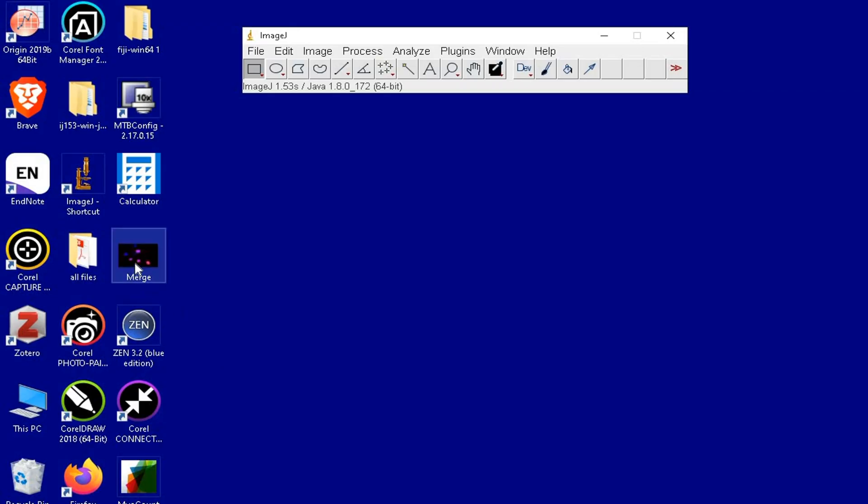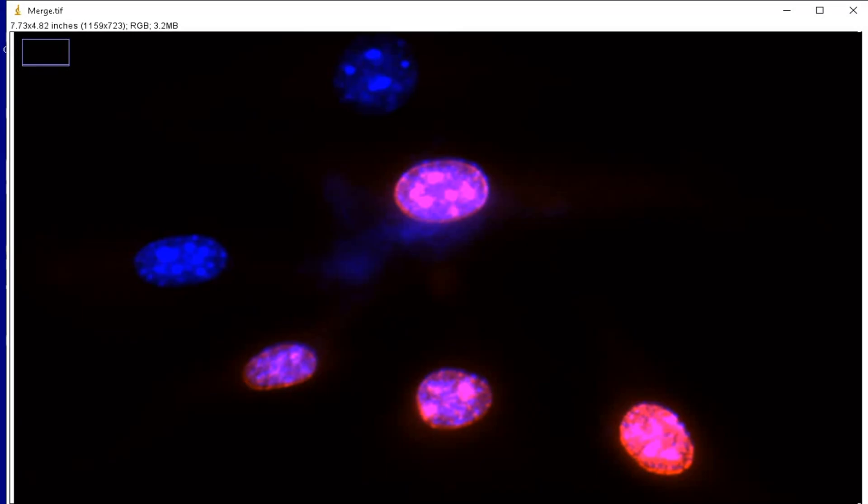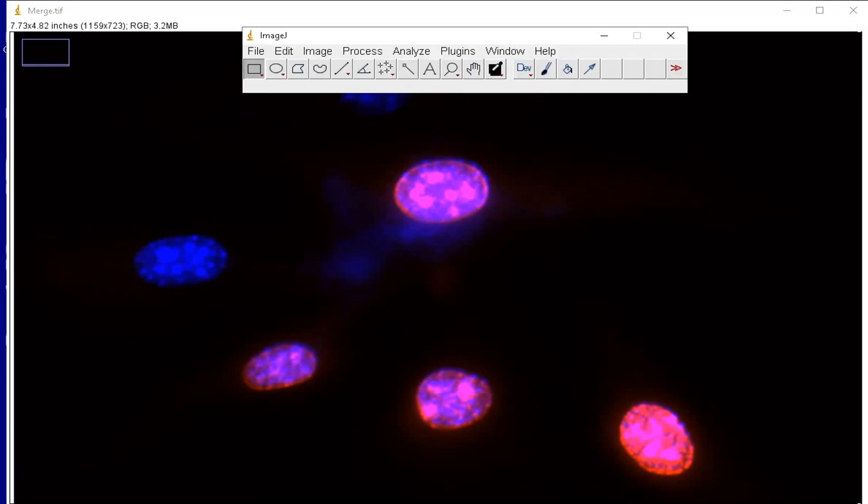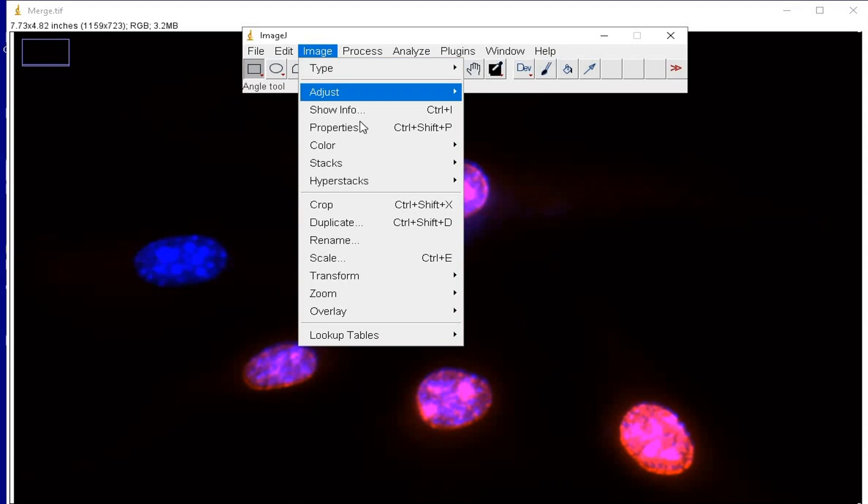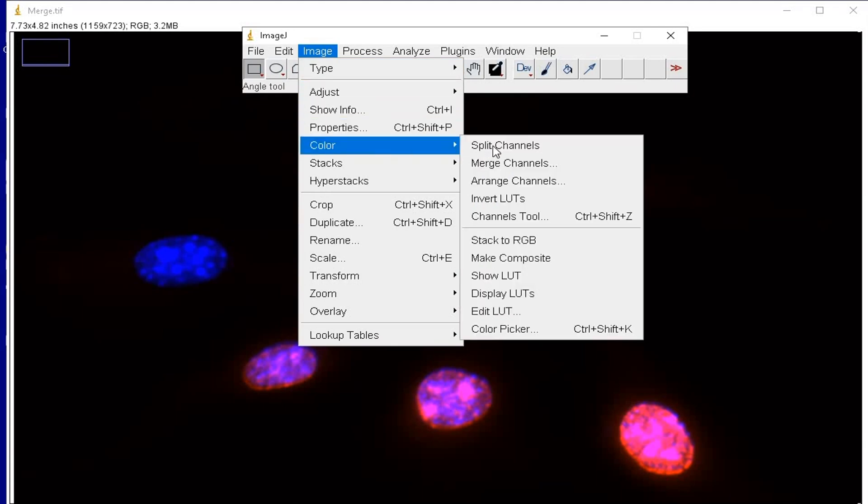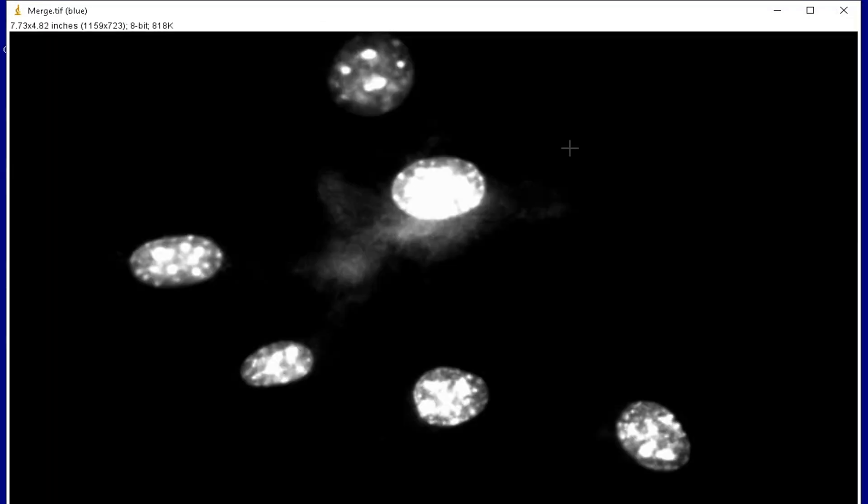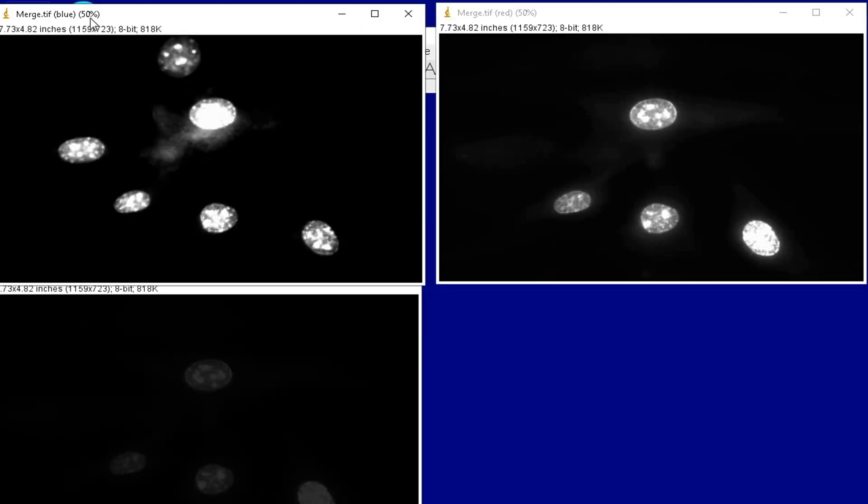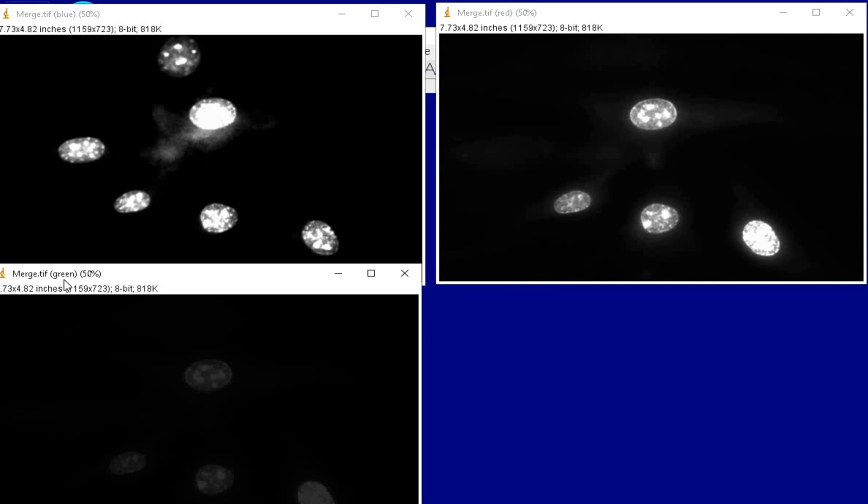Let us import the image to ImageJ by drag and drop method. Next split the color channels by clicking on Image, Color, and Split Channels. At this stage the images are converted into 8-bit images and split into three different images. The first image is from the blue channel DAPI and the second image is from the red channel Ki67 staining. We can disregard the image from the third channel in green.